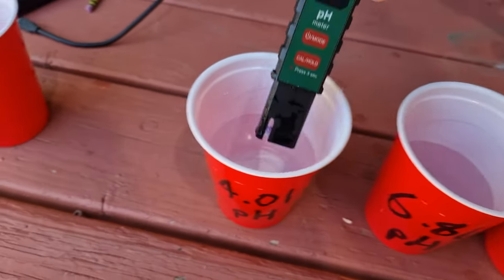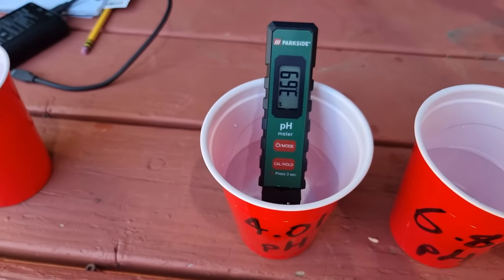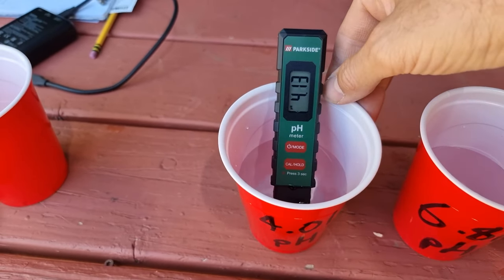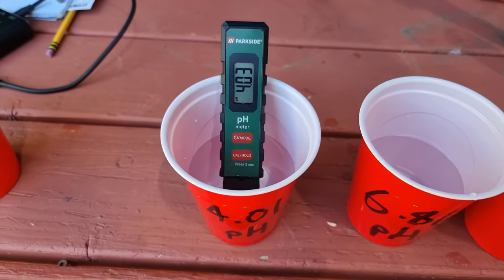Then we're going to put that into the 4.01 buffer, swill it around a bit, and there we go: 4.03 — and that's without letting it sit there too long. 4.03, 4.01. Beautiful.